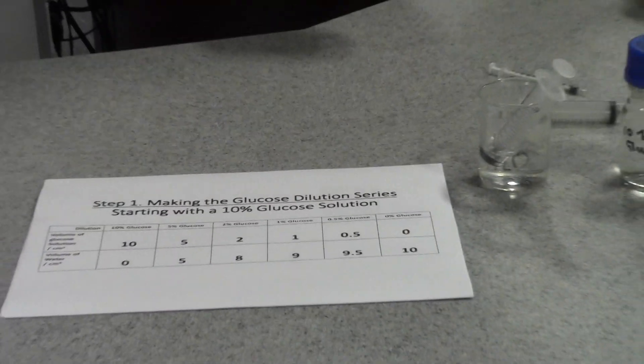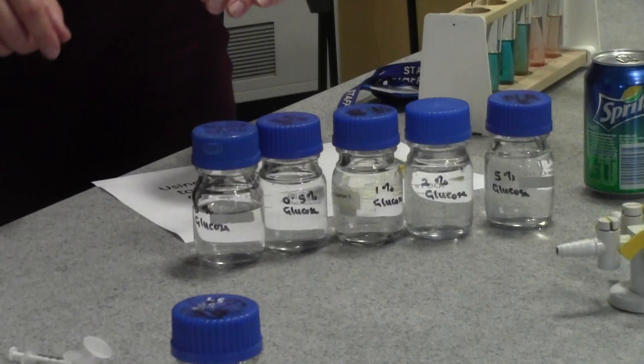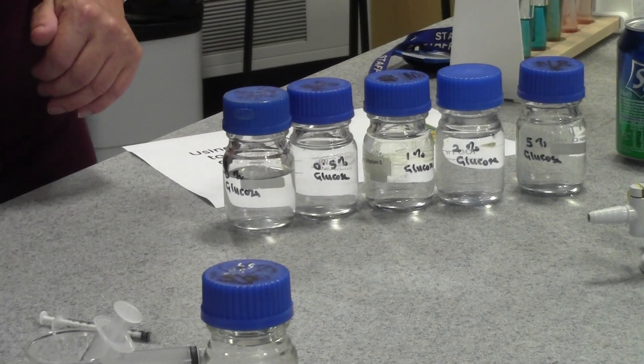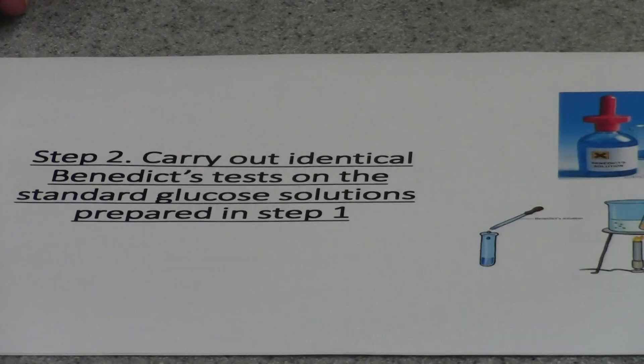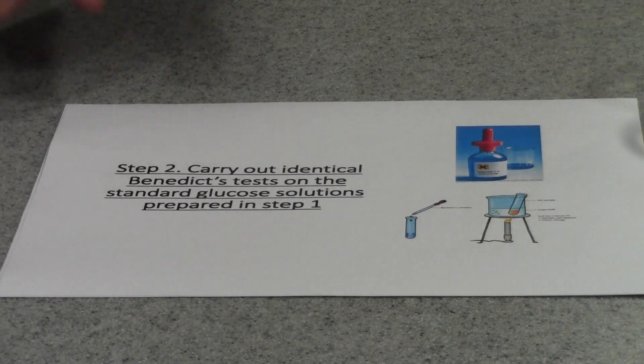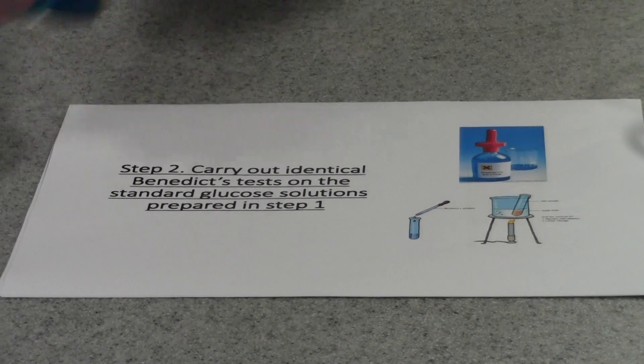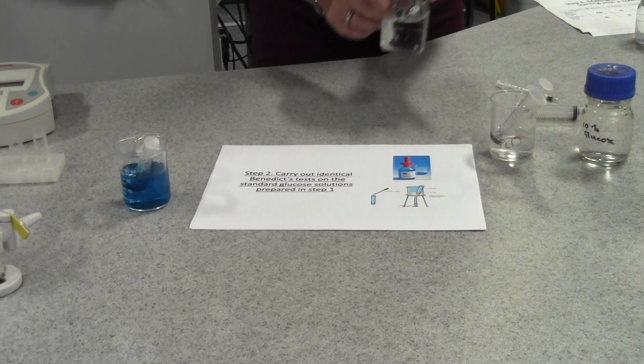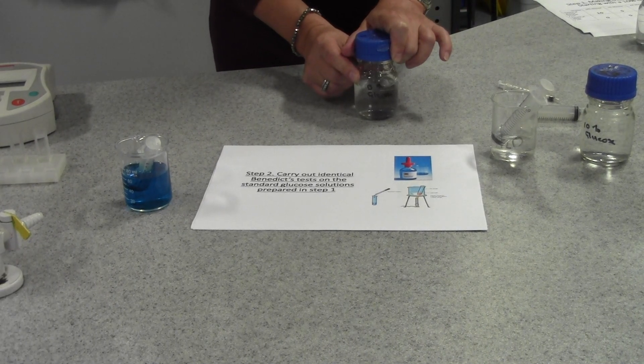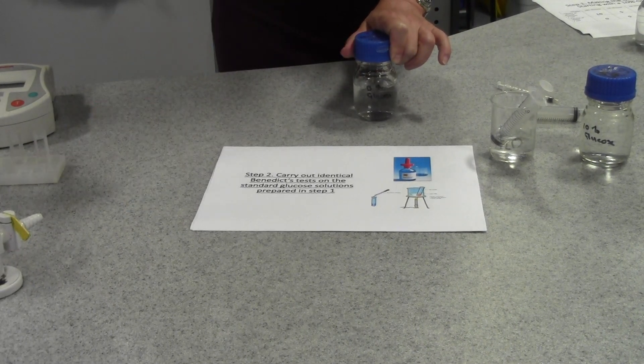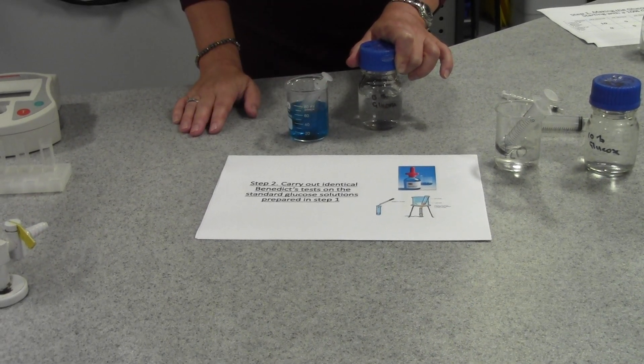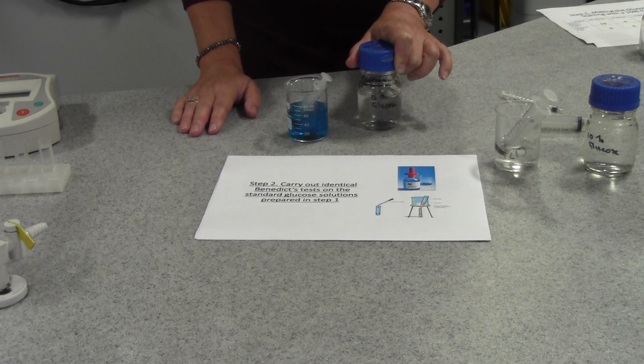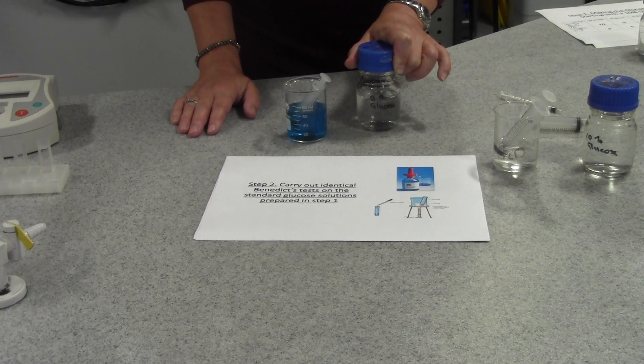Once we've got our range of solutions, the next thing we're going to do is actually carry out a Benedict's test on these solutions. To carry out a Benedict's test, for each solution we will take 1 centimeter cubed of the solution in the test tube and we will add 5 centimeters cubed of Benedict's reagent. We will then place the solutions in a water bath at 90 degrees for 5 minutes for the reaction to take place.